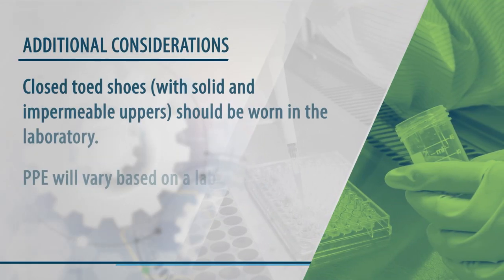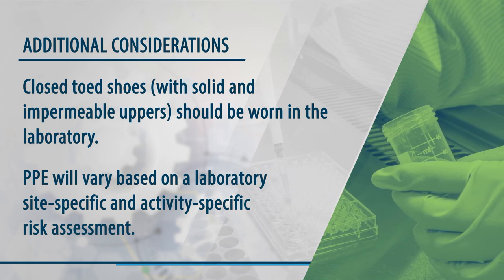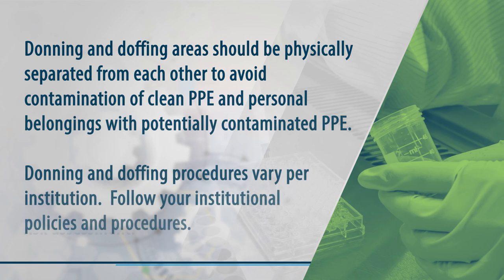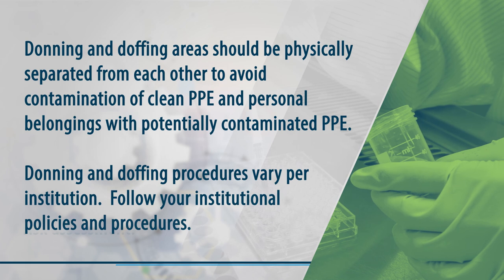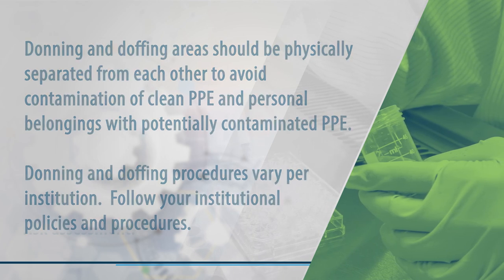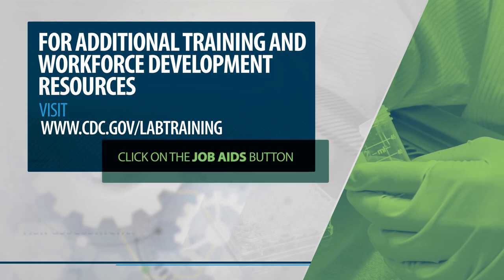Additional considerations: closed-toed shoes with solid and impermeable uppers should be worn in the laboratory. PPE will vary based on a laboratory site-specific and activity-specific risk assessment. Donning and doffing areas should be physically separated from each other to avoid contamination of clean PPE and personal belongings with potentially contaminated PPE. Donning and doffing procedures vary per institution — follow institutional policies and procedures. For additional training and workforce development resources, please visit cdc.gov/lab-training and click on the Job Aids button.